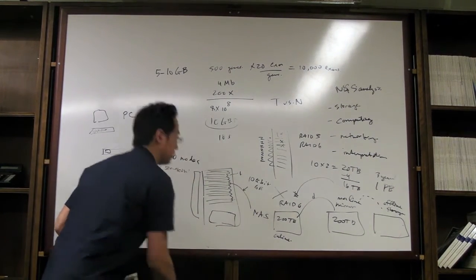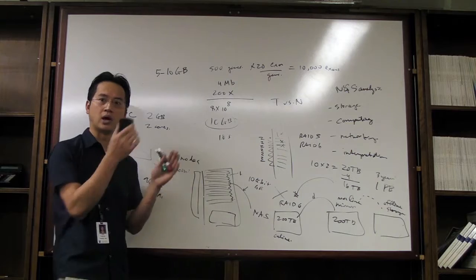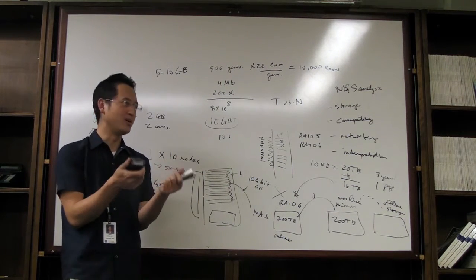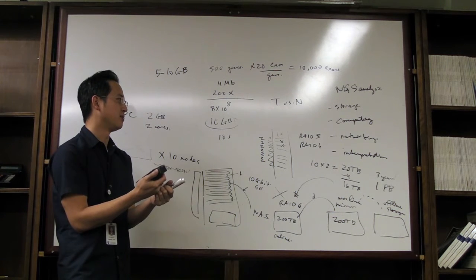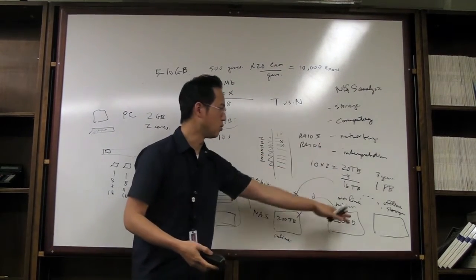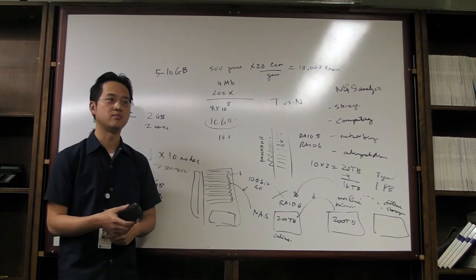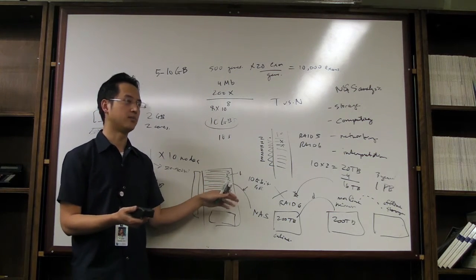So this is the infrastructure, right? I talked about infrastructure very briefly yesterday or the other day. The wet lab needs to be in place so you can do library construction and capture, and you should be able to automate it so that you don't have 10 techs. BB can attest to this. Making 30 libraries by hand is not fun, so you need automation for that. But on the computing side, you also need the infrastructure, because this requires probably 1 full-time IT person to help maintain it. And then the analysis itself and the interpretation takes 2 or 3 bioinformaticians and people to make sense of the data. So we are not there yet with the infrastructure, but that needs to be in place.